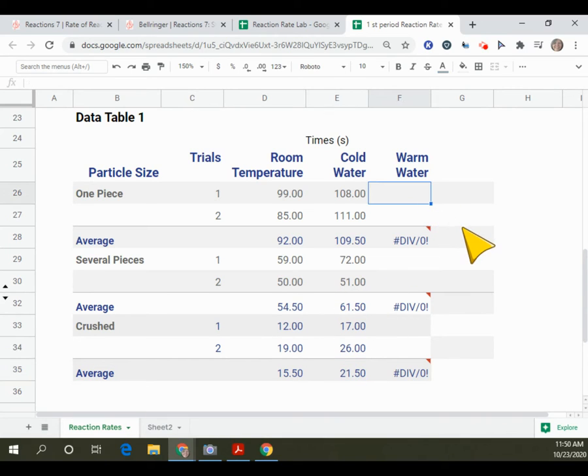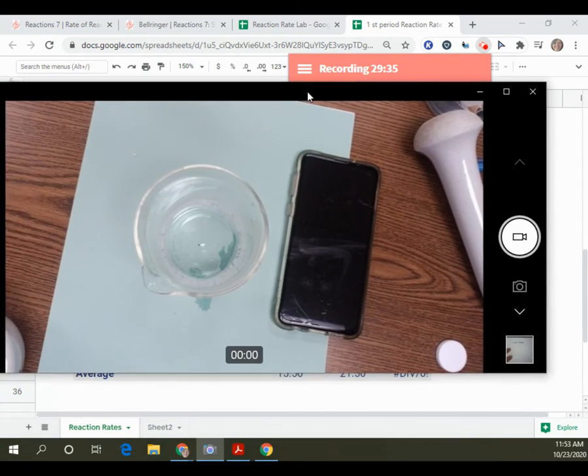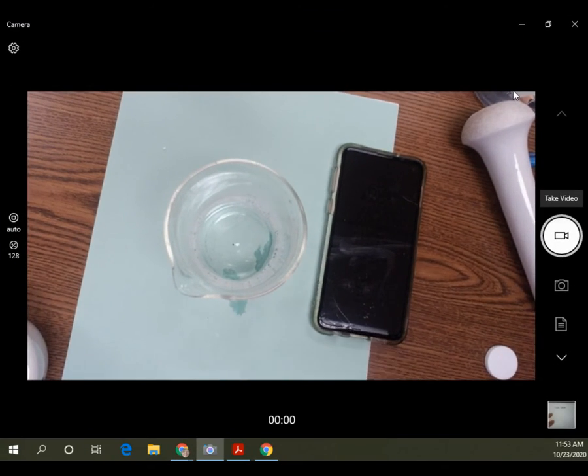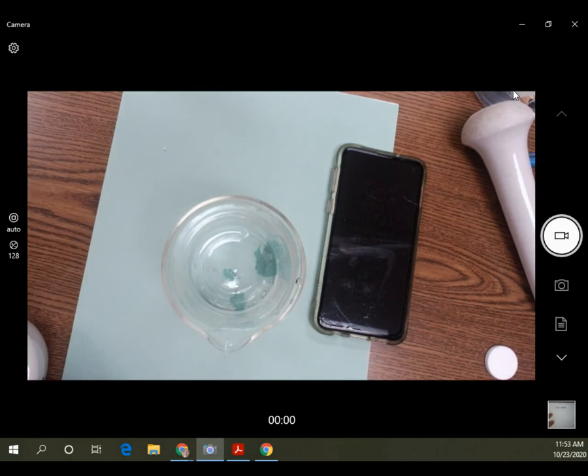All right, let's try warm water from the tea kettle and do the same kind of activities with the water from the tea kettle. All right, so let's go ahead with what we were doing here. We're going to start with the hot water from the tea kettle. All right, so I'm going to get 15 milliliters of the warm water, the hot water.